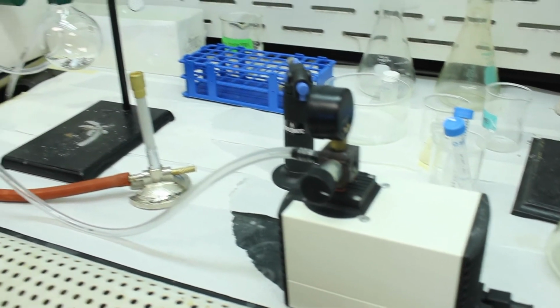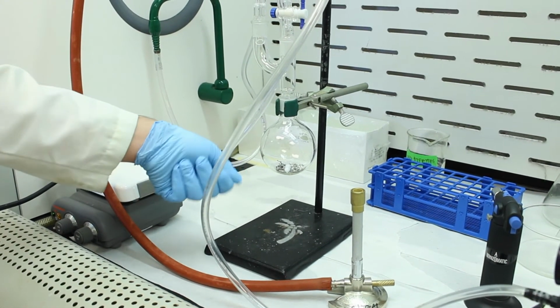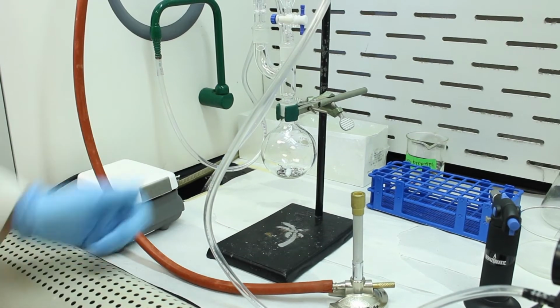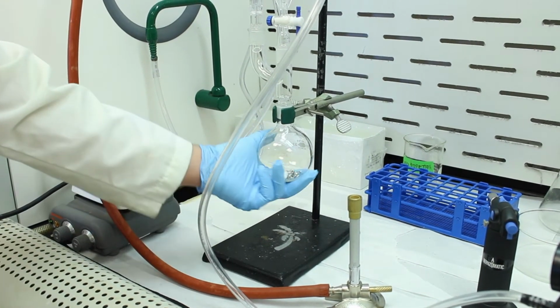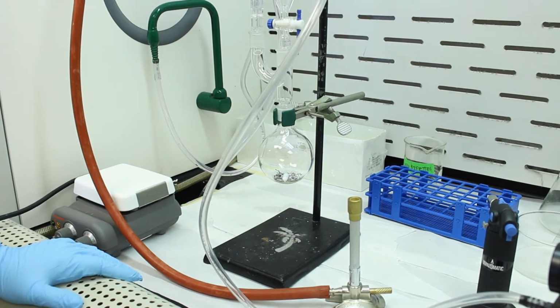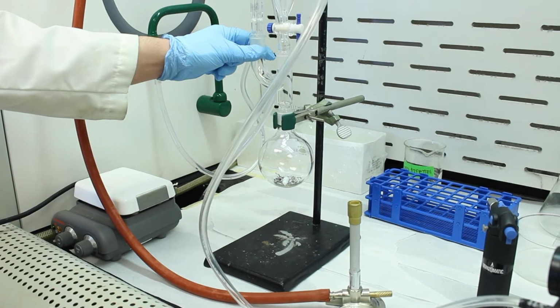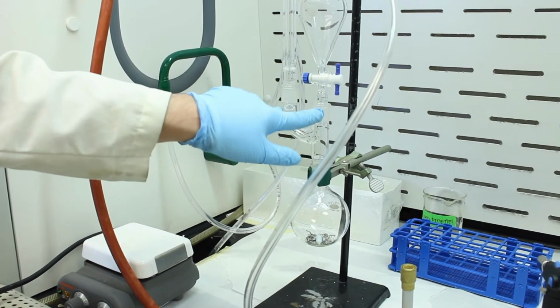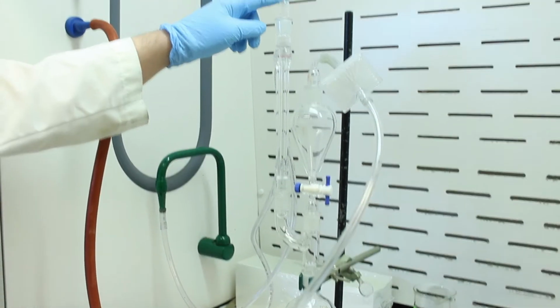When you flame dry, you've got to be careful, especially when you're doing it under vacuum. You don't want to linger in any one spot for an extended period of time. I've also checked the glassware for cracks since we're putting it under vacuum. There are no cracks. Sometimes a crack in your flask could lead to an implosion, but here we're good. So we have our round bottom flask, a Claisen head with two different pieces on it, a sep funnel which we're using as an addition funnel, and then a condenser.